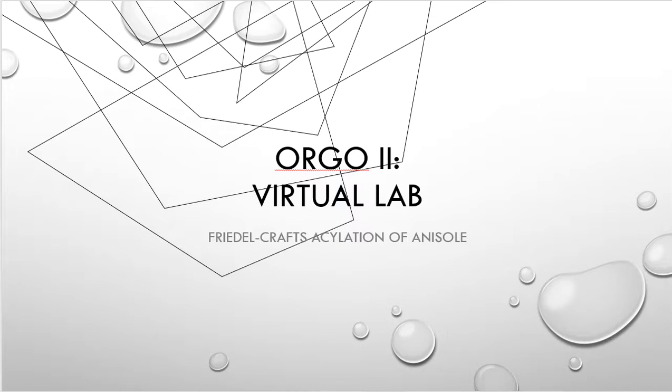So in this laboratory video, we are focused on this really fancy title. And the fancy title is called Friedel-Crafts Acylation of Anisole. Say that 5 times fast. Friedel-Crafts Acylation of Anisole. Ha ha, I did it. Can you?